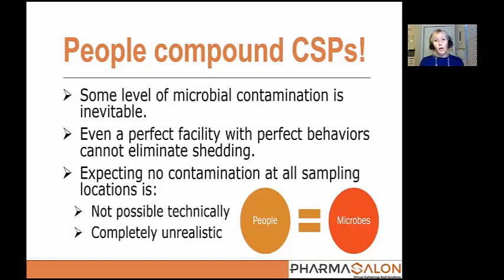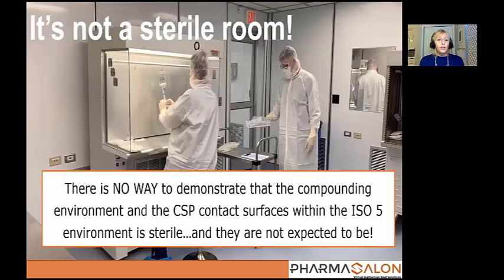We're going to have people in the compounding environment. It means there's going to be microorganisms in that environment, and ultimately that is okay, because it's not whether or not we have an exceeded action level or we've recovered one of those highly pathogenic organisms, it's what we do about it. A couple other reminders here.